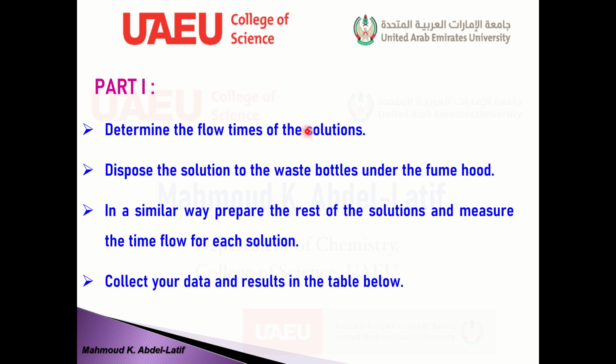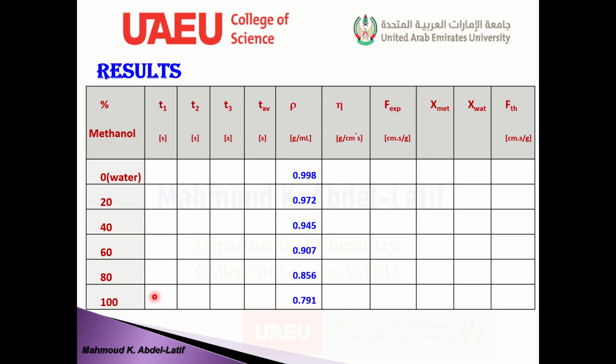Okay, and we follow the same procedure for all solutions we have, just to collect our data in the following table. Instead of measuring the density of each solution, it's given. This is the density for pure water, which is the reference one, and this is the percentage of methanol, just by volume.